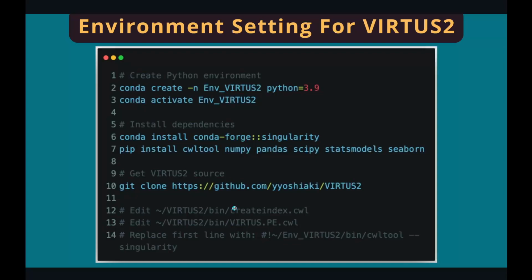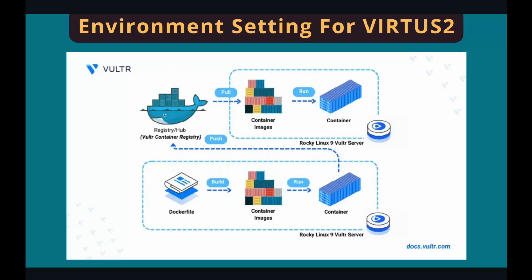So what is Docker? Remember the conda environment I introduced in my first tutorial. They are independent environments with a set of tools for a task. For example, you create an environment for RNA sequencing data with all the tools in it, so you can use it independently. Well, Docker goes further. It not only packs the entire environment into a container, it also includes the whole operating system in the container.